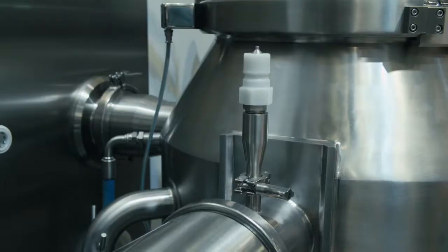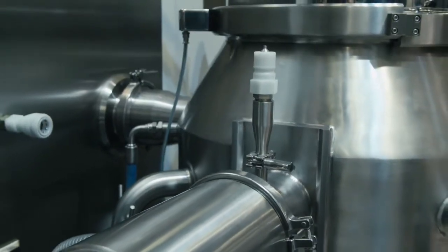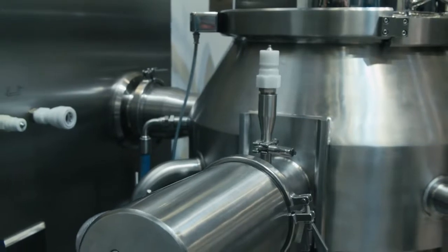One of the great things about the PharmaConnect Plus is not only does it carry out the high shear granulation process, but we can also add an IBC blender. That means that after the fluid bed drying we can add post-granulation excipients and carry out blending of those materials, so that IBC can be taken over to a tablet press and the material can be compressed into tablets.